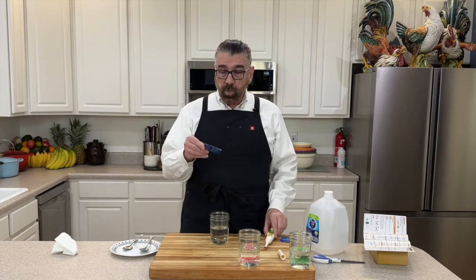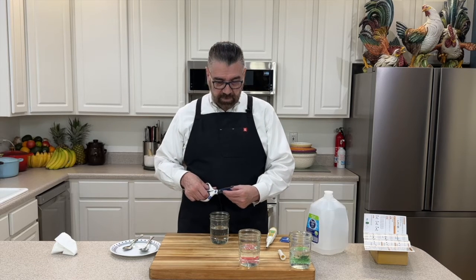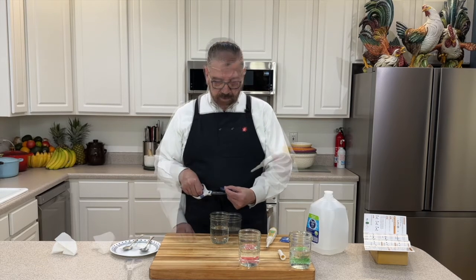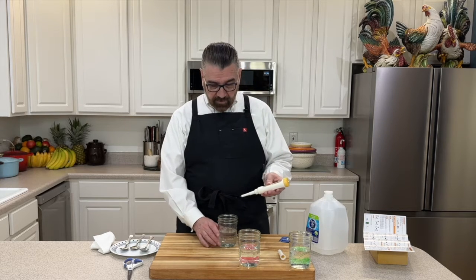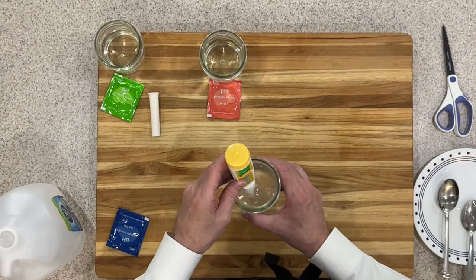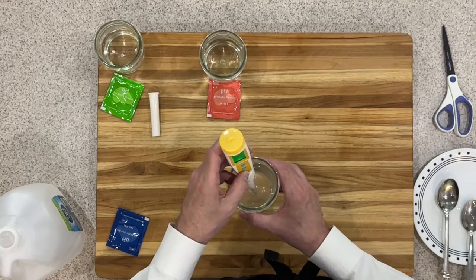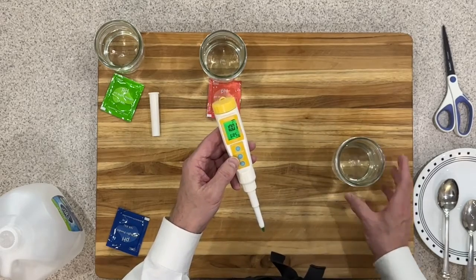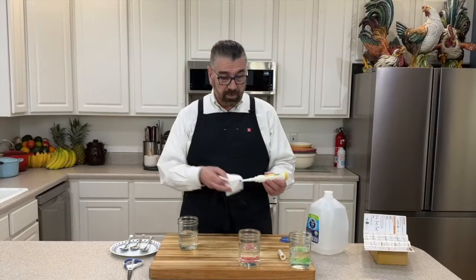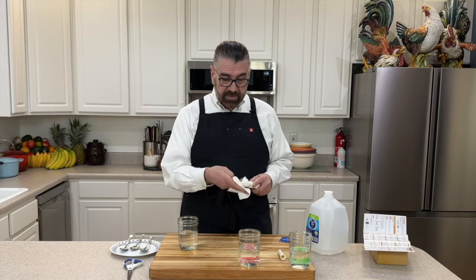After rinsing the probe again, I dissolve the blue 10.01 buffer packet into the third jar of distilled water. I insert the probe and once the reading stabilizes, I press and hold calibrate for five seconds. The screen shows 10.01, confirming a good calibration on all three points. The meter is now fully calibrated and ready to use.